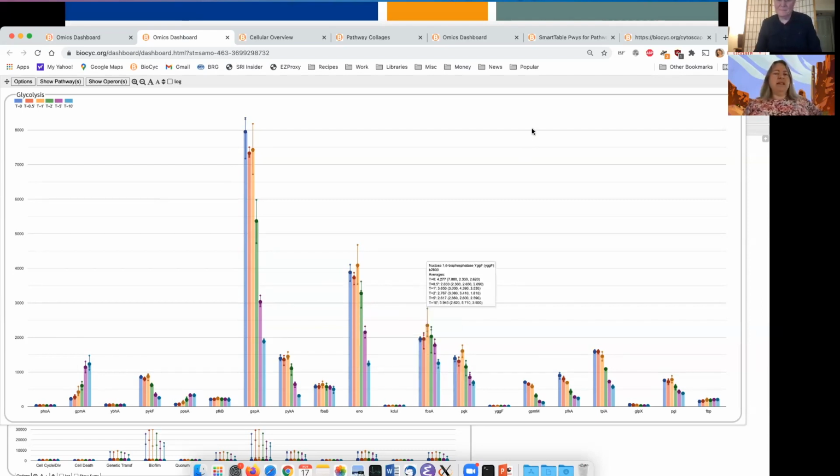So again, as I said, when you have a lot of data and we're having to do the average, the tool is a bit slower to interact with, but we can handle that. Our other omics analysis tools really don't handle that at all. So you're going to want to average your replicates before you submit the data. I hope that answers the question.